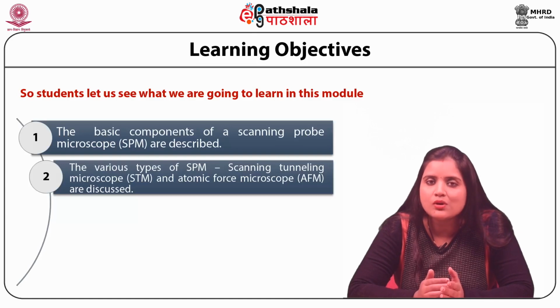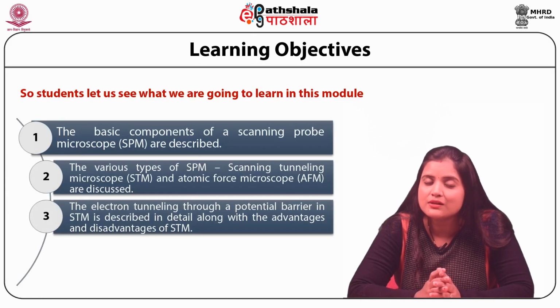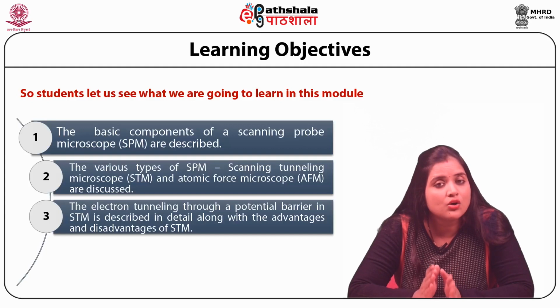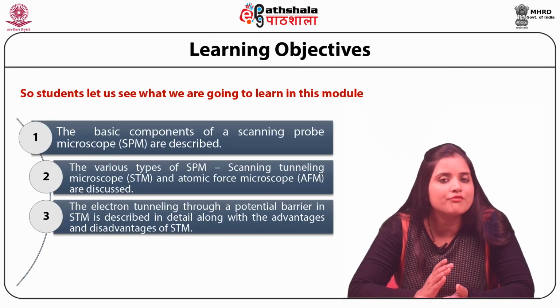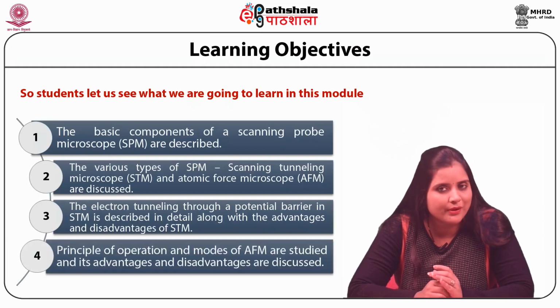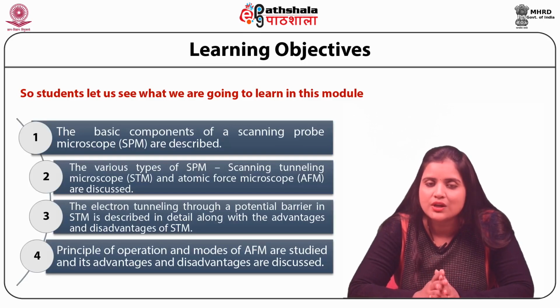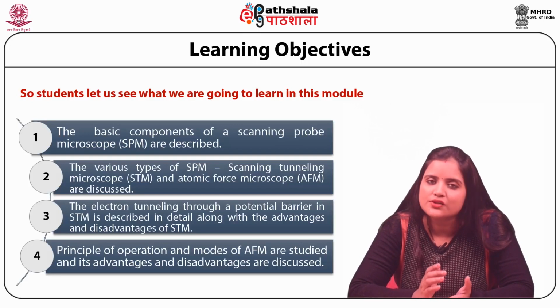In this module, the electron tunneling through a potential barrier in STM is described in detail along with the advantages and disadvantages of STM. Then, the principle of operation and modes of AFM are studied and its advantages and disadvantages are discussed.